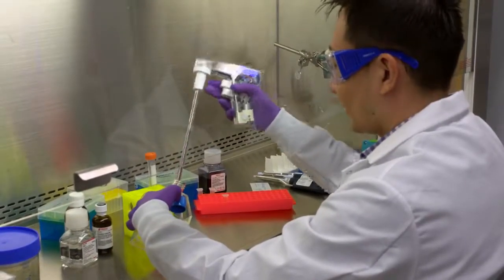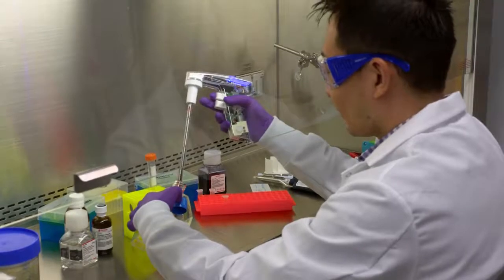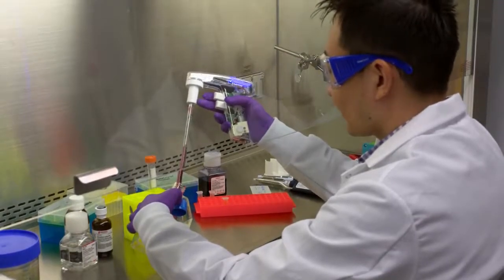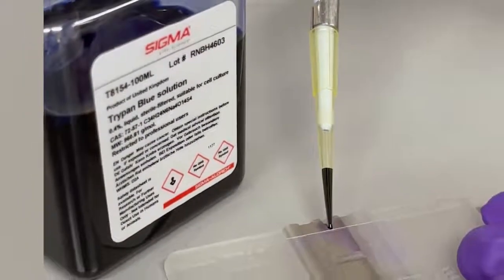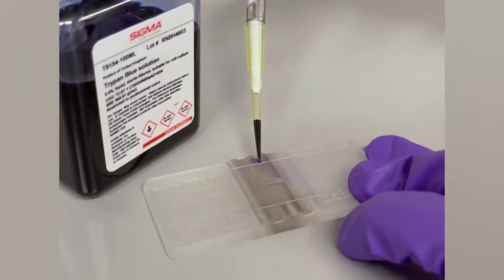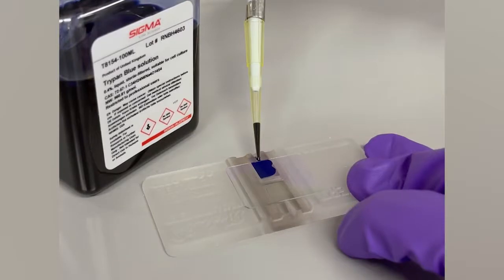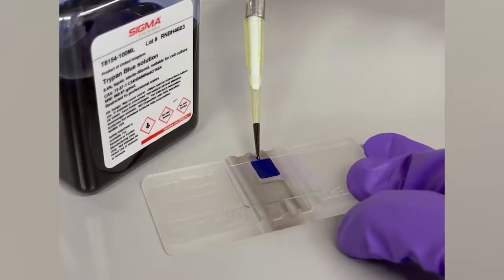Simply put, it is a glass chamber with precisely defined grid geometry and depth. Cell solutions are usually mixed one-to-one with Trypan Blue and then loaded into the opening between the glass cover slip and the cell counter itself.